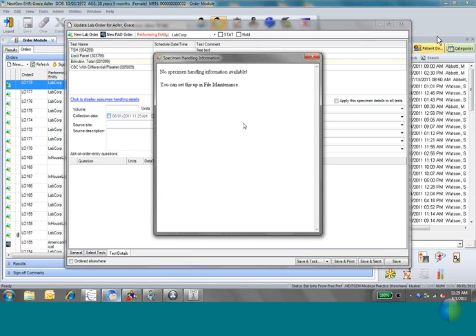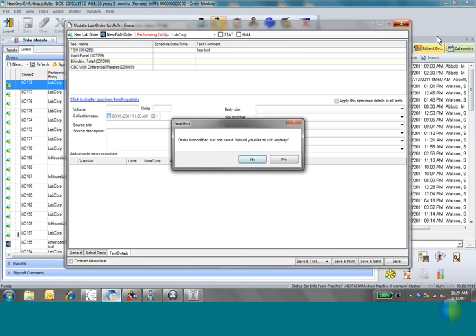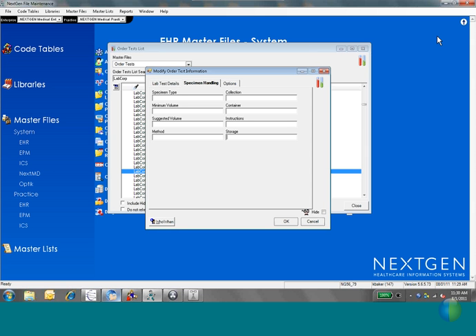It doesn't fill out or default anything, and it doesn't reference it directly on the same screen, but at least users can pull this up in a pop-up and use the information if they need to. What I typically tell everybody is that if the users collecting the specimen already know what is expected of that specimen, then you don't really need to worry about this part.